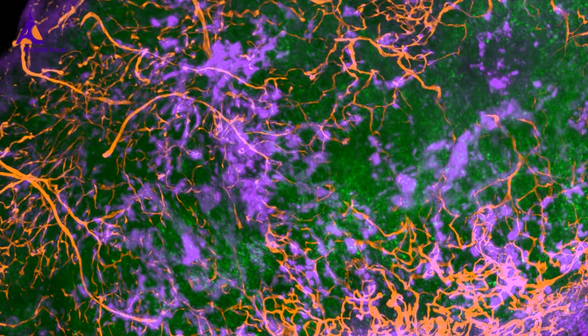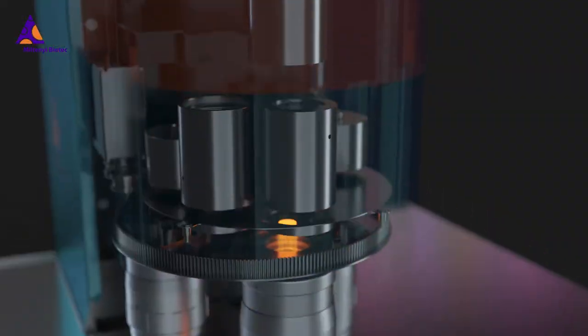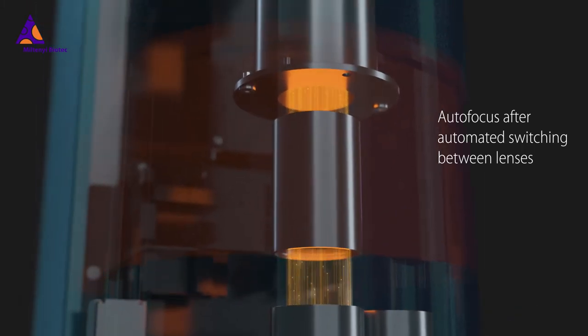Scientists look at the big picture and study the details. The instrument allows automated switching between different objectives and magnification lenses.